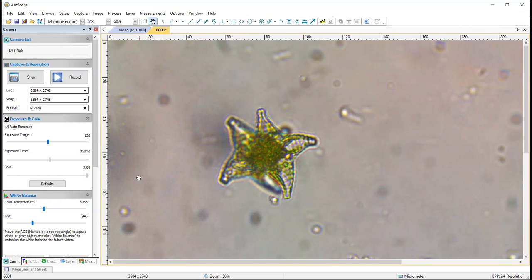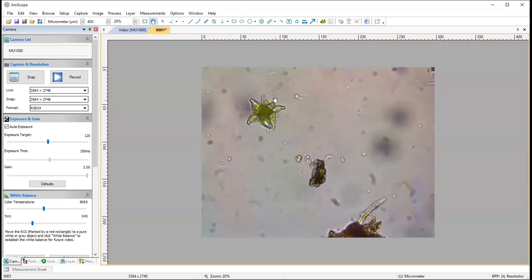One thing that I highly recommend, if you have a specimen that only takes up a small portion of the picture, right? Saving this entire high resolution picture will make for a really large file. So I recommend cropping first. You should do that not completely tight around the specimen, because maybe you'll want to put a scale bar there somewhere. It's certainly better to leave some space around the specimen, but you certainly don't need 3/4 of this picture.